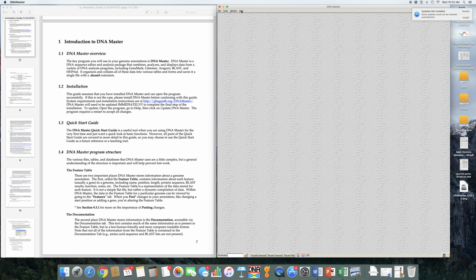The first thing I'm going to ask you to do, and I'm not going to do it because I'm having trouble connecting to, I guess, the DNA Master site, is to go to the Help section, scroll down to Update DNA Master and click on that. And it should just take a couple of seconds to update your DNA Master, but it's really important the first time that you open DNA Master that you update it. And again, I'm not going to do it because for some reason it's taking a long time to do on my computer, and I've already updated my DNA Master in any case.